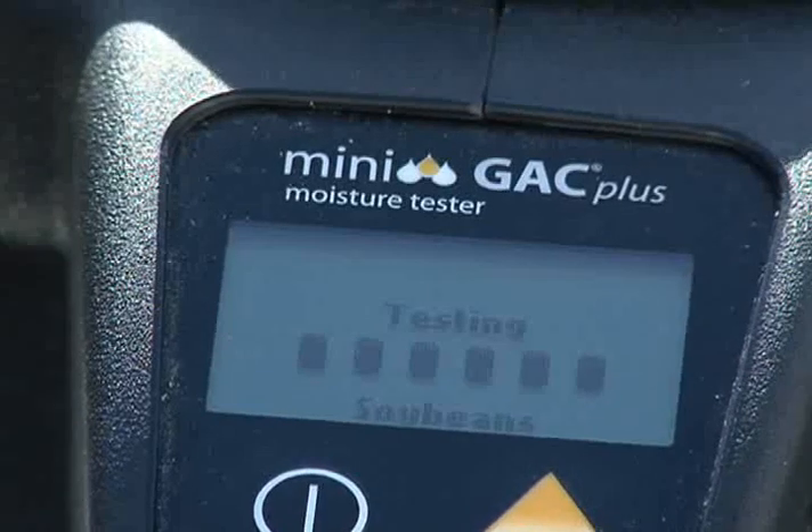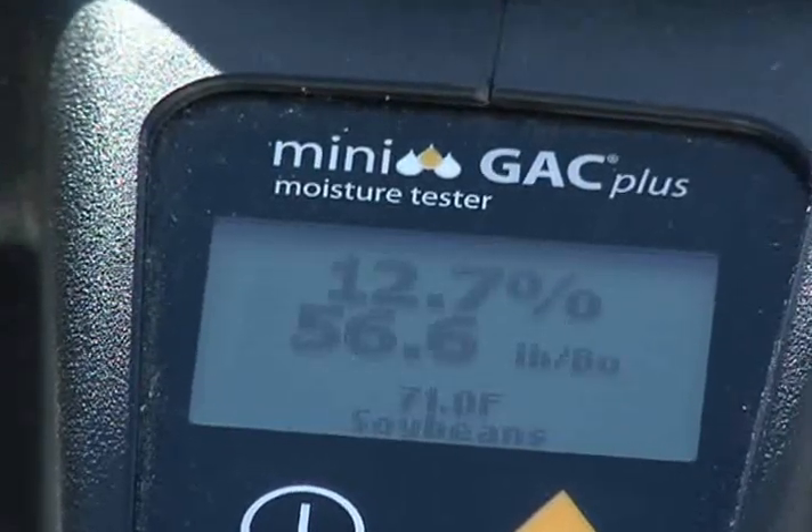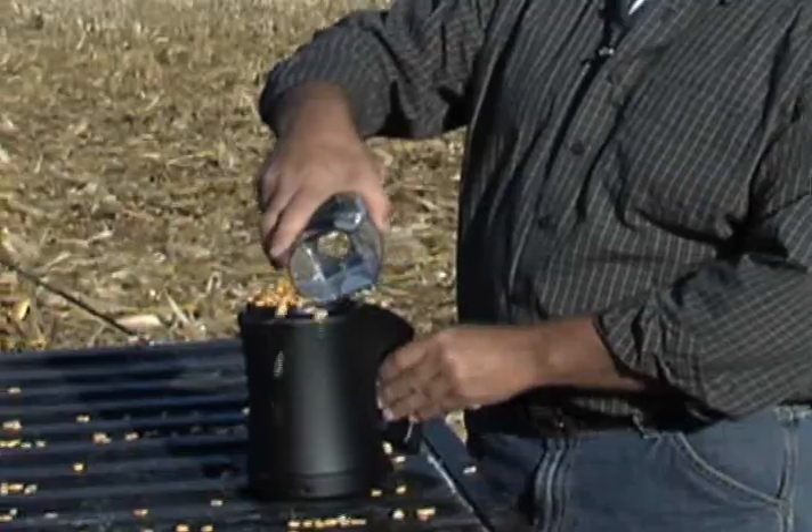After you press enter, you'll have moisture and, if you're using the Minigak Plus, test weight results in seconds. Casey Norris has never owned a Minigak Plus, but it only took him a couple of minutes to get the hang of it, and then he was able to demonstrate how to use it.